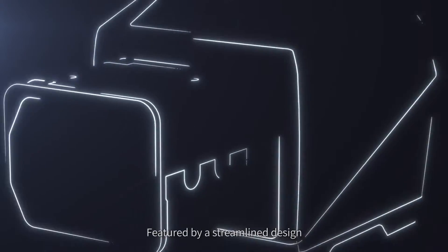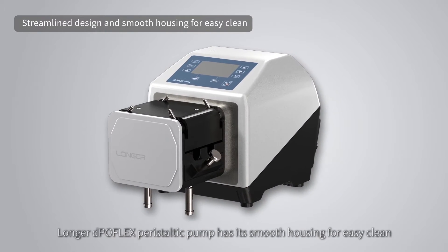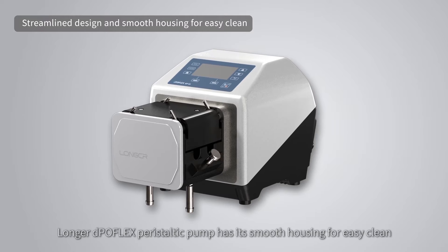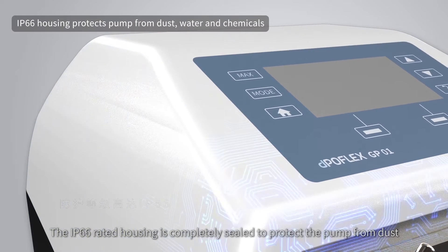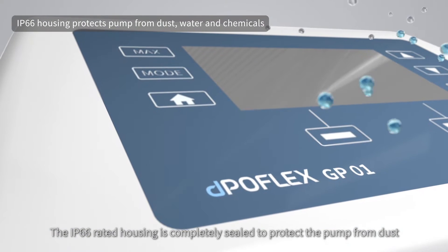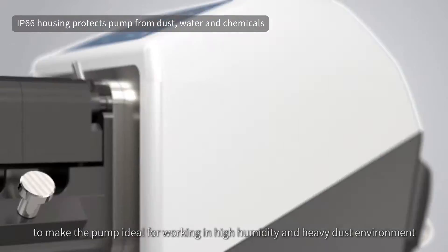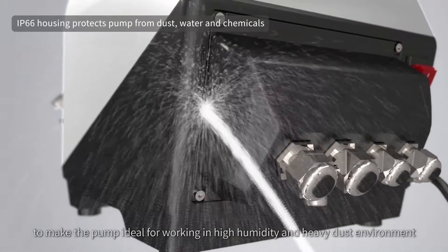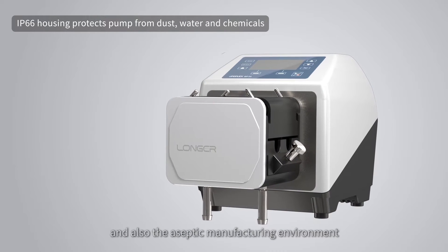Featured by a streamlined design, Longer Depoflex peristaltic pump has a smooth housing for easy cleaning. The IP66-rated housing is completely sealed to protect the pump from dust, water, and chemicals, making the pump ideal for working in high humidity and heavy dust environments, and also aseptic manufacturing environments.